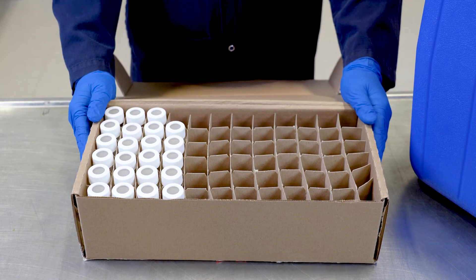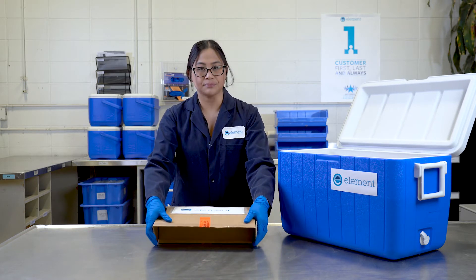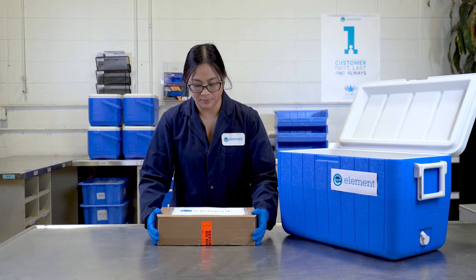One important thing to note is that if you are testing for methanol, you should ship those samples in a cooler that does not contain methanol vials. Another thing to keep in mind is that if you are shipping methanol vials, you don't exceed any dangerous goods regulations.